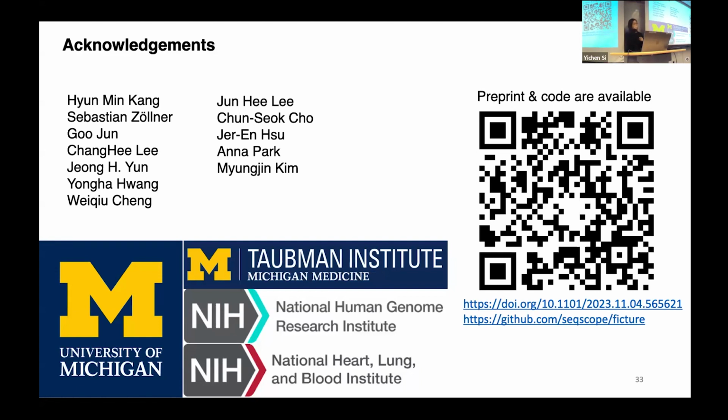We can do that, but I would be cautious: if you want to find ligands, precise segmentation is very important, and it's better if you have more information on the cell morphology. But with only our method, you can do conditional analysis on the factors to see which genes are enriched at the boundaries between them.